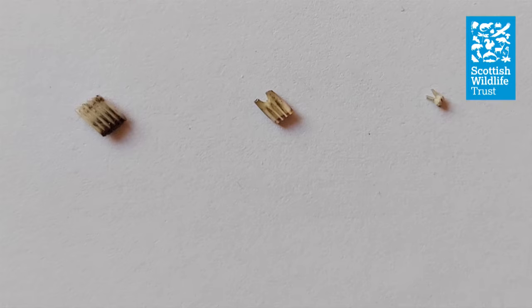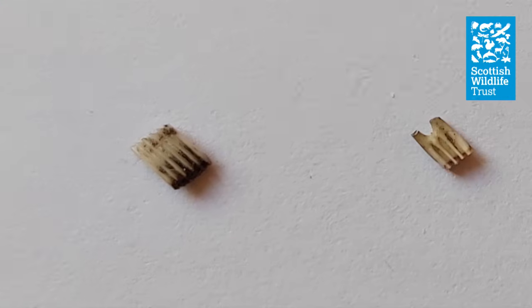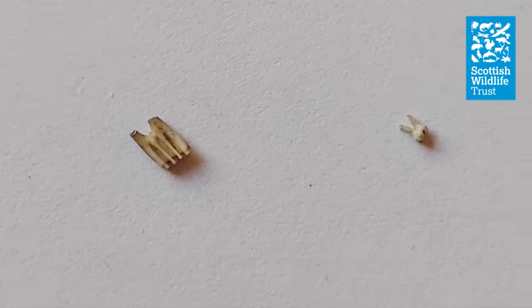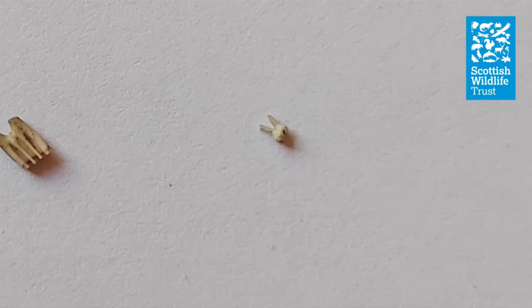If you decide you have a rodent skull, you'll need to take a closer look at the teeth to work out what species it is. Use your tweezers to gently pull out a tooth from the back of the jawbone and take a closer look at it using your magnifying glass. Field vole teeth have grooves that run all the way from one end of the tooth to the other, and have no obvious root to the tooth. Bank voles, on the other hand, have grooves that only run part of the way down the tooth and have two clear roots. Mice teeth are much smaller and look like miniature human teeth — they're rounded, cusped and have two clear roots.